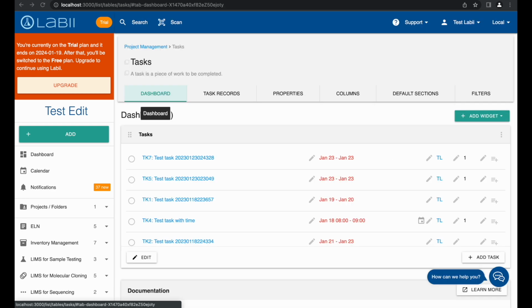Once submitted, you will be redirected back to the task dashboard page. In default, the dashboard only displays the started but incompleted tasks. In case you need to display other tasks on the dashboard, you can make use of the Edit button to select a different filter.